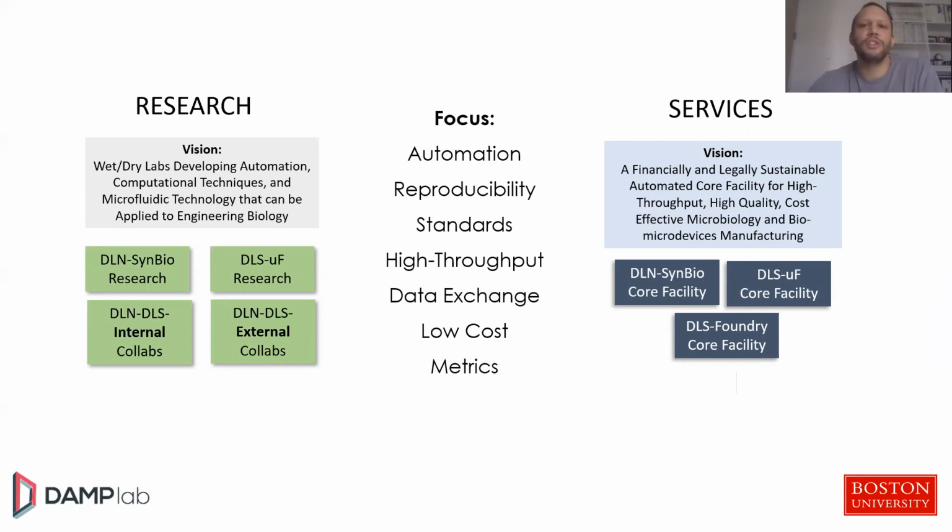And I want to draw your attention to two of these. One is reproducibility, the other is metrics. We want to really measure and quantify how well we can do these designs, and we want to do them in a very repeatable way. What I do on Monday, I want to be able to do on Friday, and what I do in my lab, I want you to be able to do in your lab. All of the automation in the world is not going to be very helpful if we can't measure how well it's being done and if we can't reproduce it.